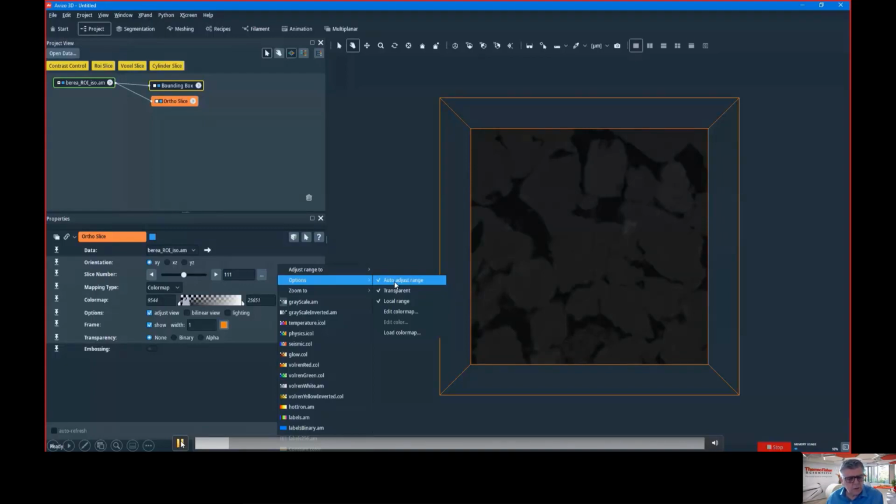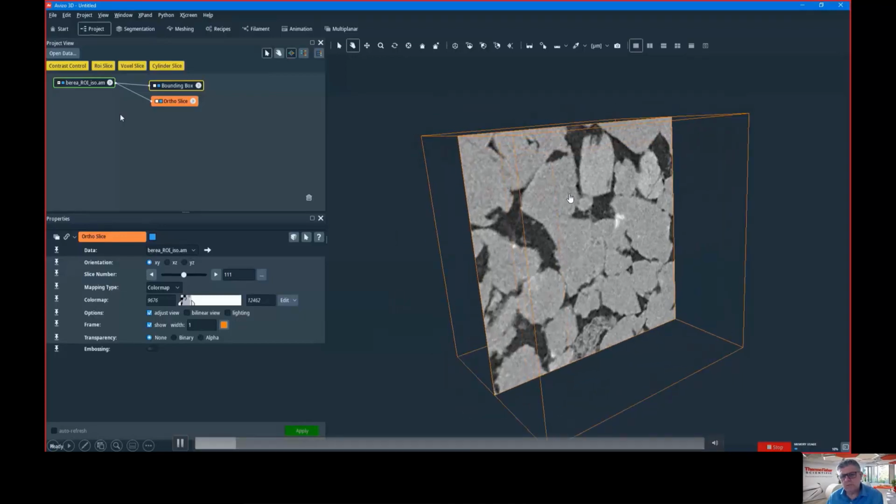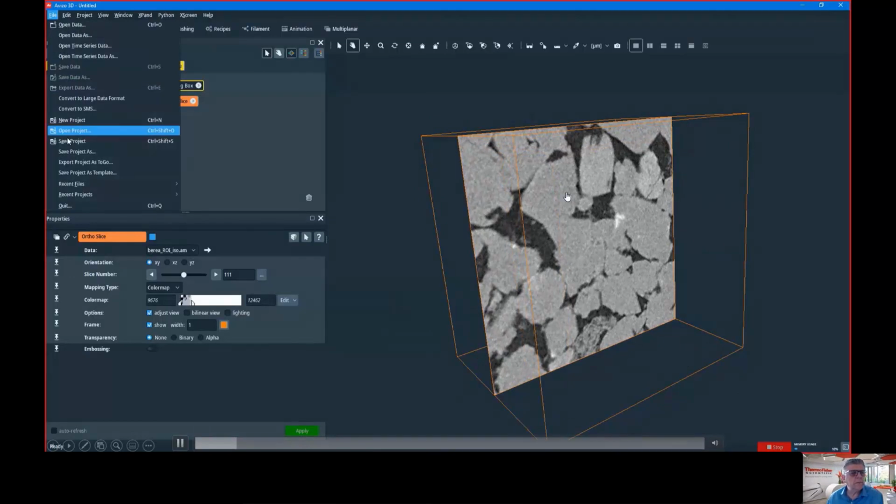I don't want my ortho slice to continuously go back. The other thing I'm going to say is focus on the data histogram, because this is what I like. Or data window, similar. Now it looks better, and this will stay on this range. It will not change automatically, because I disabled auto range. And now I can look at my data.